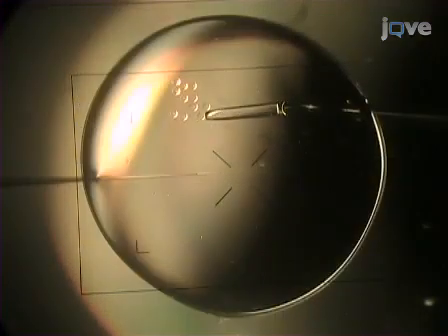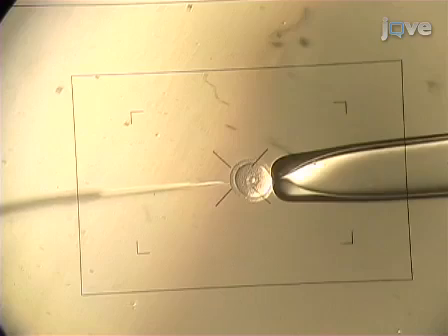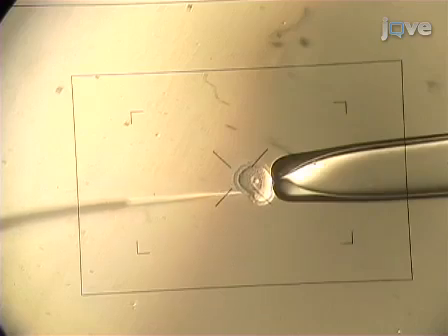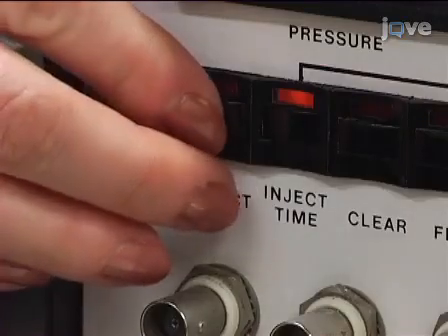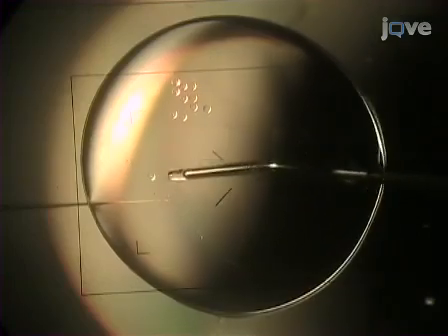Use the holding pipette to capture an oocyte and align the injection needle, oocyte, and holding pipette along the x-axis. Under higher magnification, advance the injection pipette through the oocyte, being careful to avoid the nucleus. Once the plasma membrane is pierced, press inject. After injection, withdraw the needle. Release the oocyte and repeat.